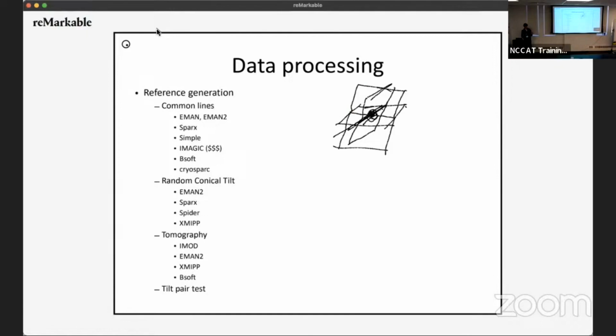So it means that if you find a common line between all those 3 particles with each other, here you are. You have an initial 3D reference because you can take those 3 particles that have been aligned to each other in Fourier space, and now you just do an inverse Fourier transform, and you get your 3D volume, and done. Obviously that would be a crappy 3D volume because you only have 3 orientations. But if you do that for 100,000 particles, obviously that 3D volume is going to be pretty sharp. Okay, and so now, where did the problem come from initially?